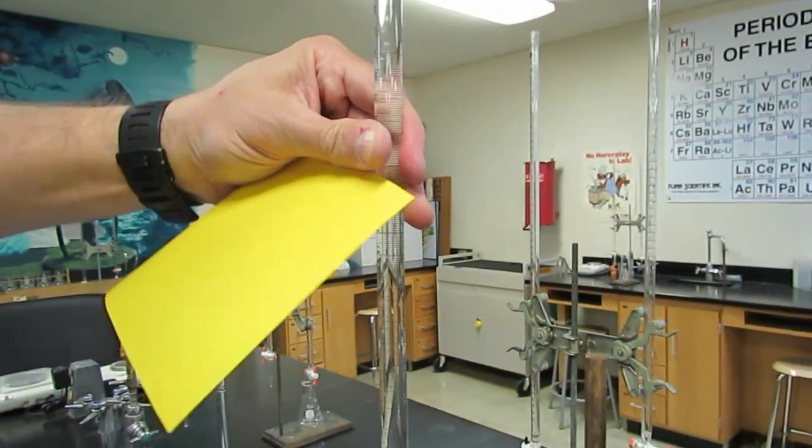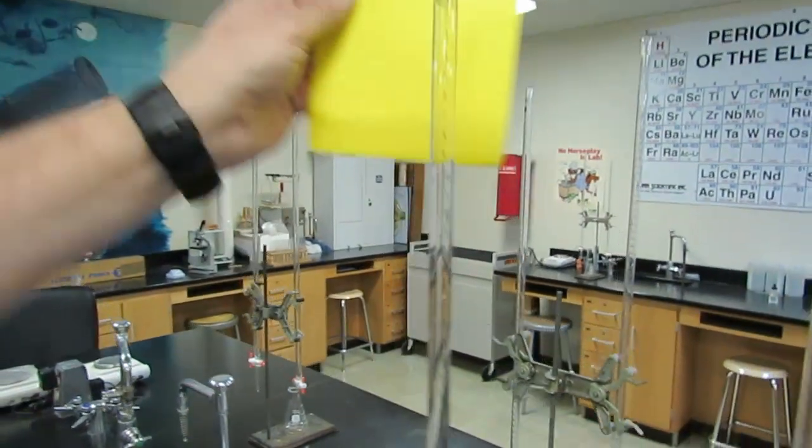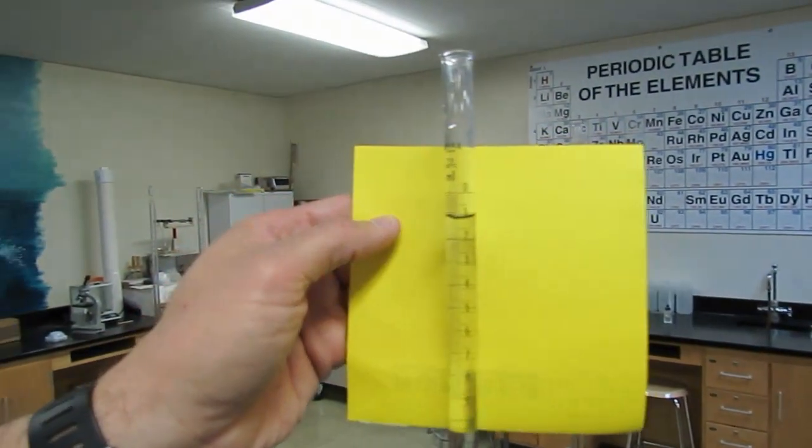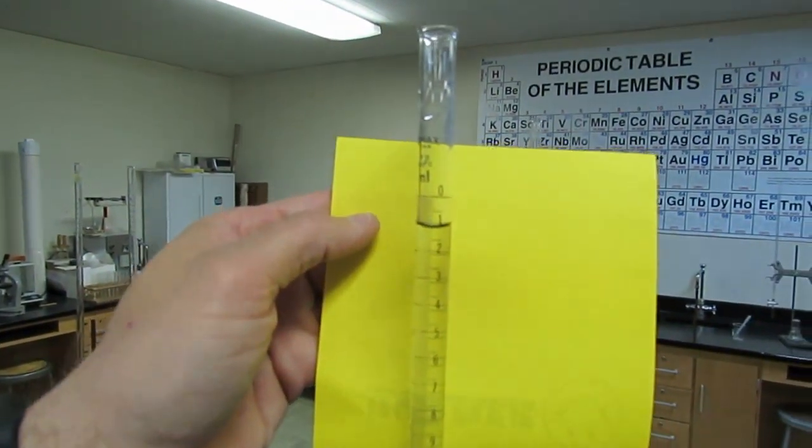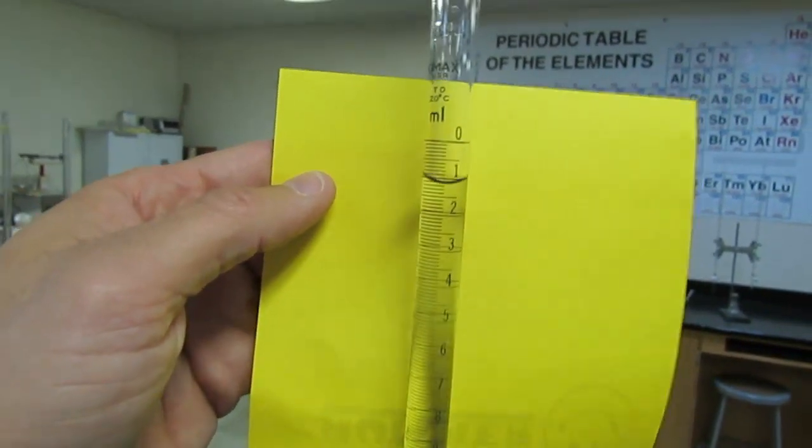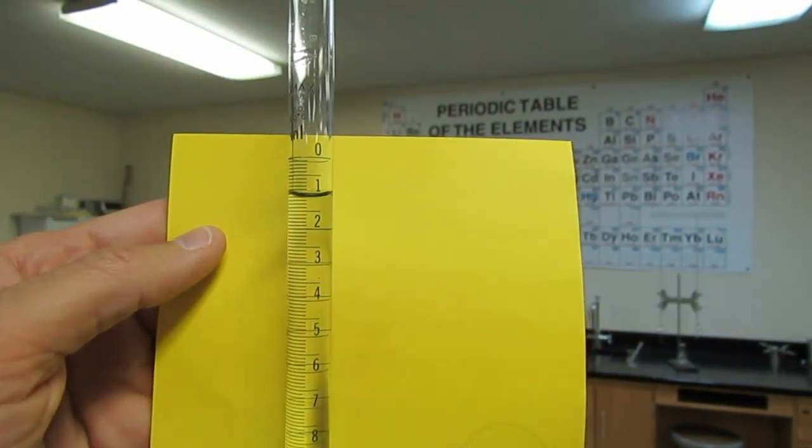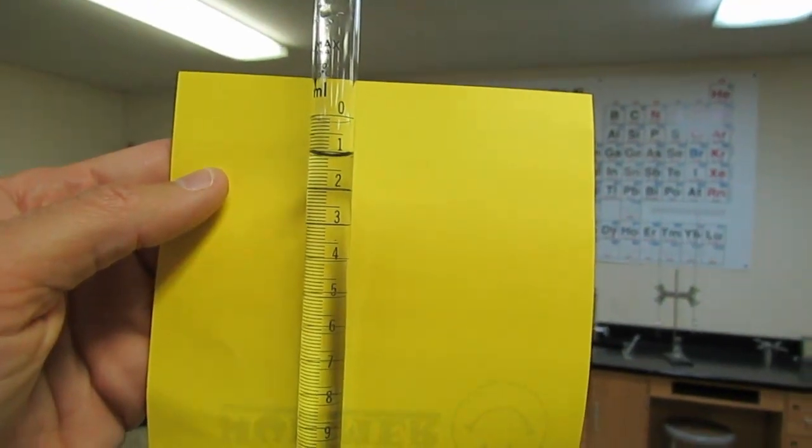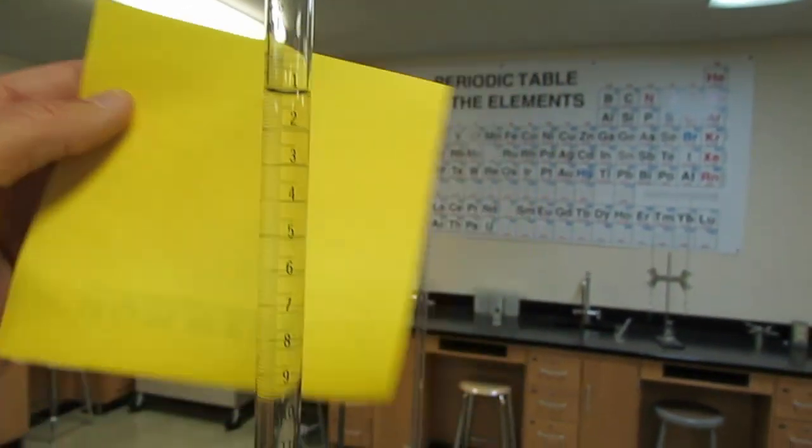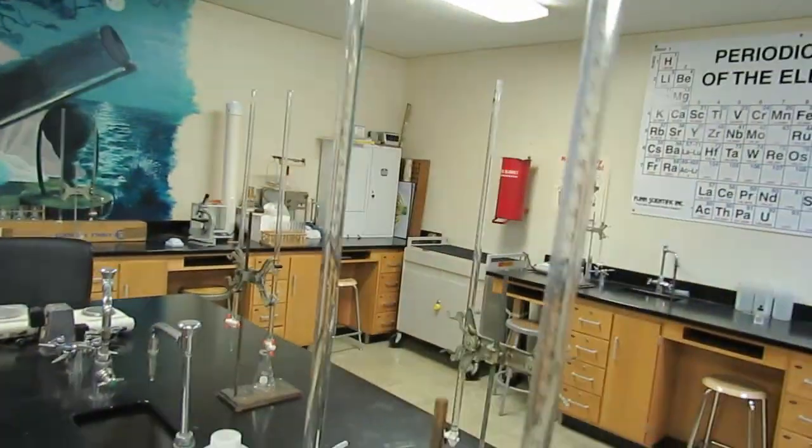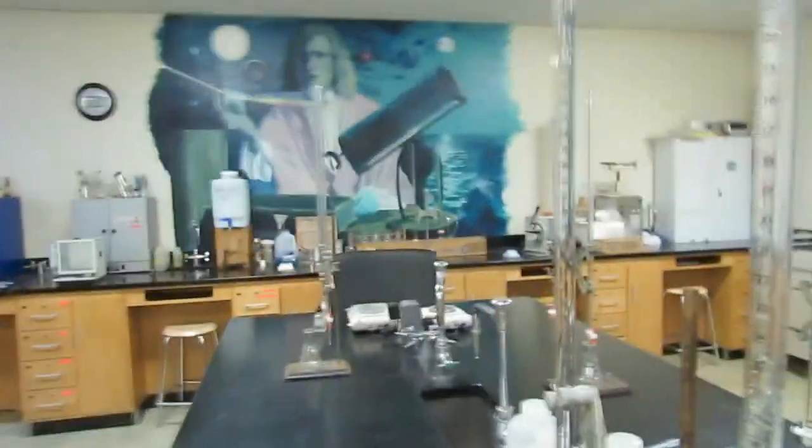For my initial acid reading, let me turn the burette so we can read that. It looks like that's going to be between one and two. So I'm going to call it 1.16. So I have my initial acid and my initial base value.